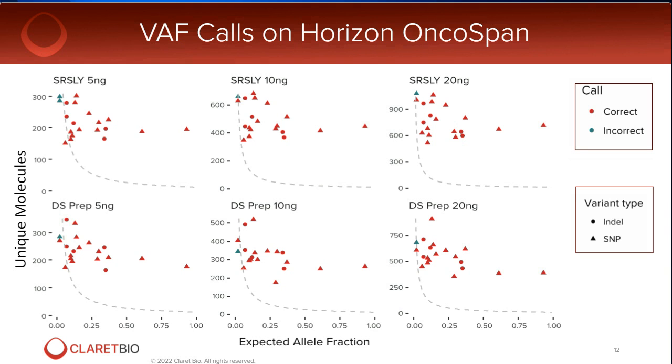However, in a true clinical situation, this would not help you because there's no way you're going to go through and manually call anything by eye. You're just using what the software spits out. So these were definitely in the standard control, as expected, but missed by the software. But if sequencing depth was higher for these, and we could basically increase the y-axis or move this asymptotic line to the left through increased sequencing depth, then the ability to call these variants would be better for these.